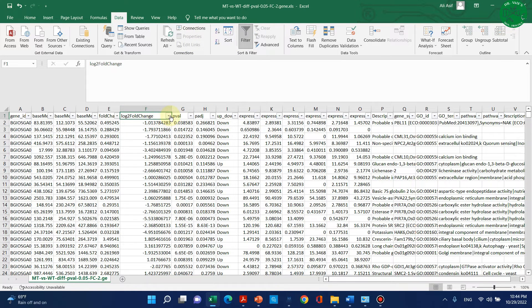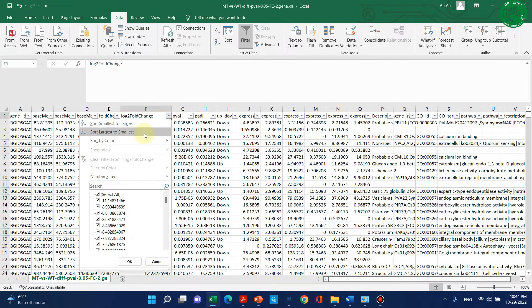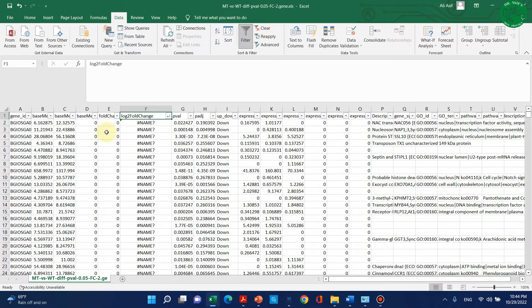Now the filter has appeared. Click on this small dropdown — it will show you how you want to sort. If we want to sort from largest to smallest, click on that option.